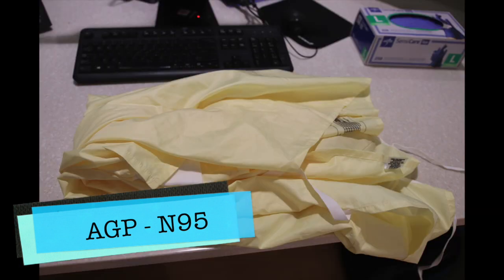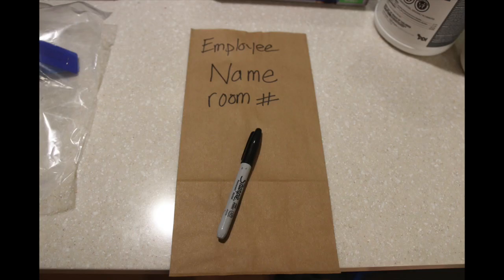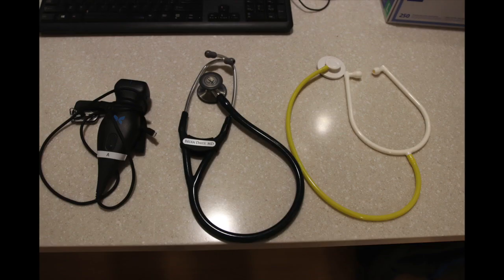This includes a gown, either disposable or reusable based on current hospital protocols, a face shield with your name on it, a bag with your name and the patient's room number on it, an N95 mask that has either been UV sterilized for reuse in the patient's room or a brand new one depending on current hospital protocols, a pair of gloves, and any other equipment you may need, including a disposable or reusable stethoscope.